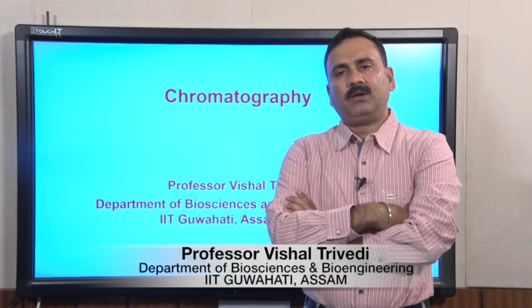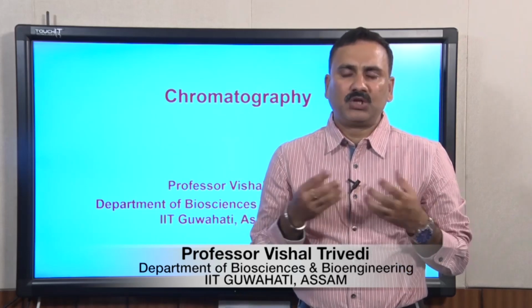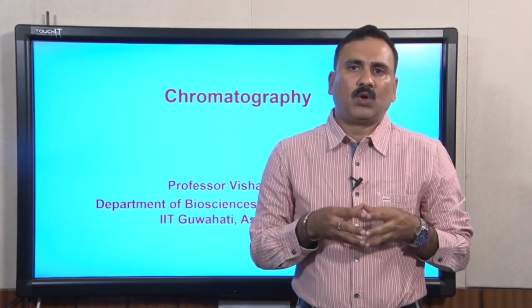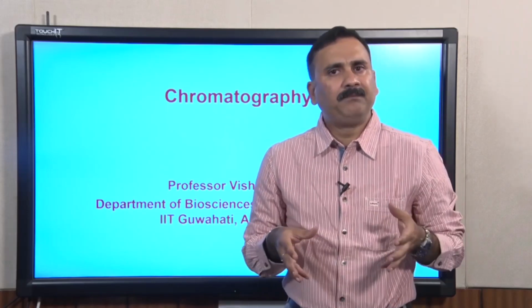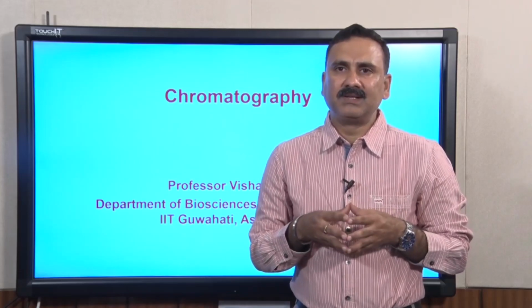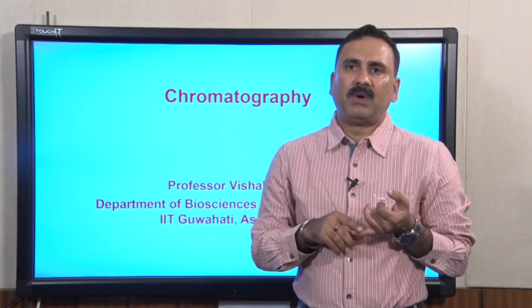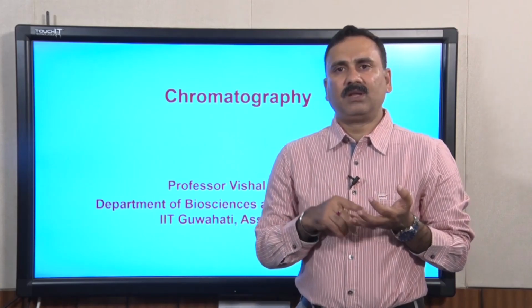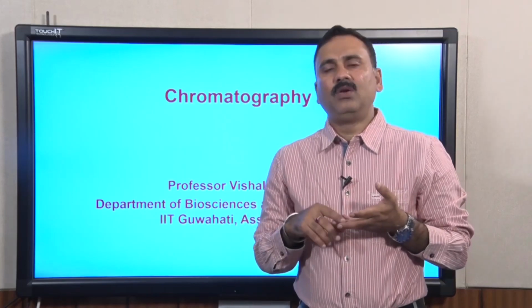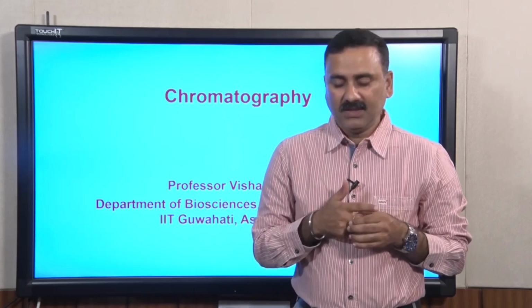In what we have discussed so far, we have discussed the extraction of products from the cells which are overexpressing your protein. In the previous lecture, we discussed how to break these cells with different methods. We discussed the physical methods, the chemical method, the enzymatic method, and at the end of the previous lecture, the mechanical processes.